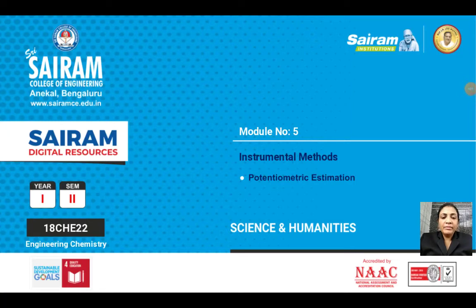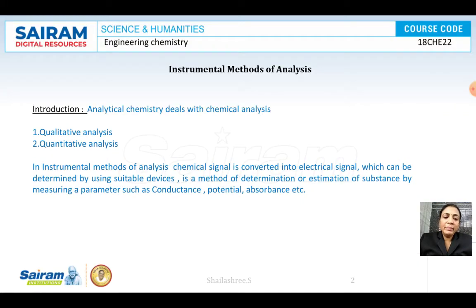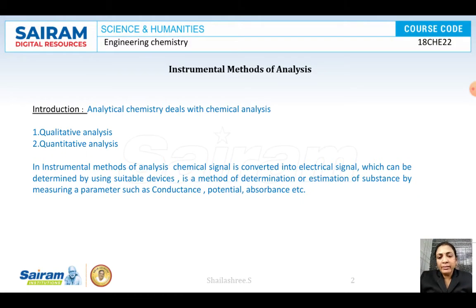Hello friends, we are in module number 5 and in this session we are starting with the first chapter, instrumental methods of analysis, and we'll be discussing the potentiometric estimation. Okay, so let us come to the topic.